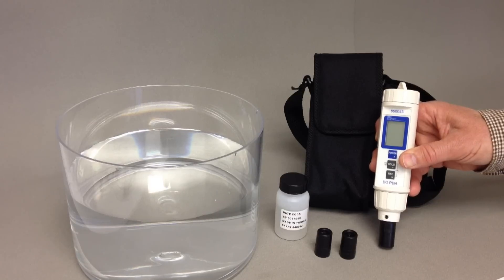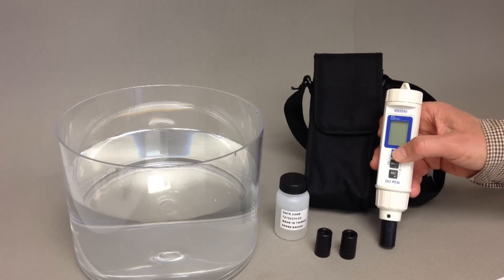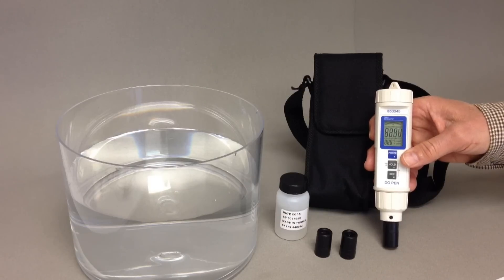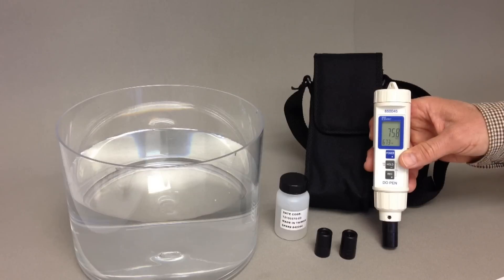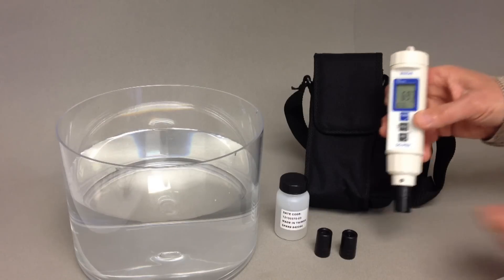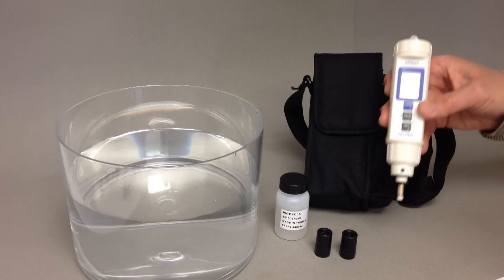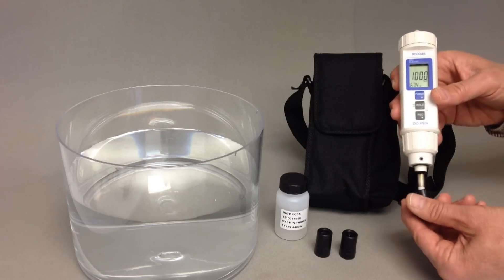Dissolved Oxygen Pen 850045 is easy to carry and sufficient for many surface dissolved oxygen measurements. The pen is designed for simple one-hand operation with automatic temperature compensation and easy calibration to air. The polarographic probe has a built-in temperature sensor and easy to replace pop-off heads.